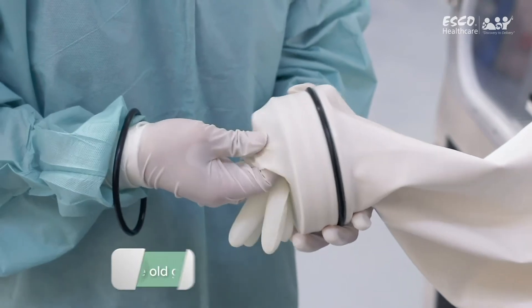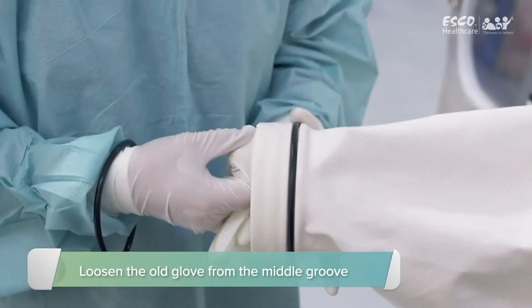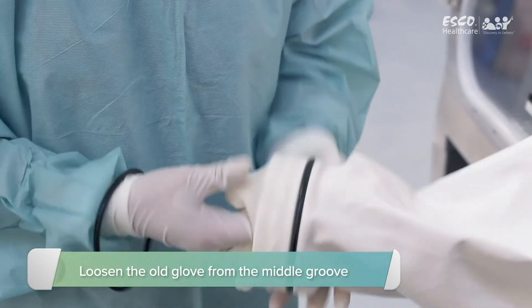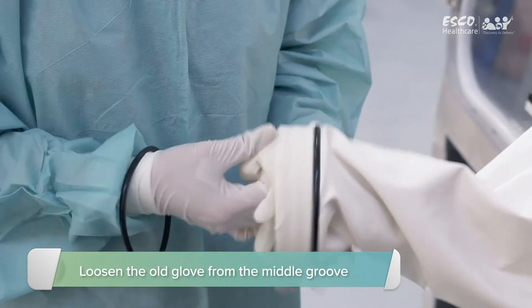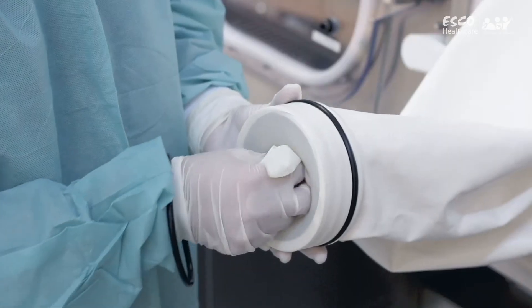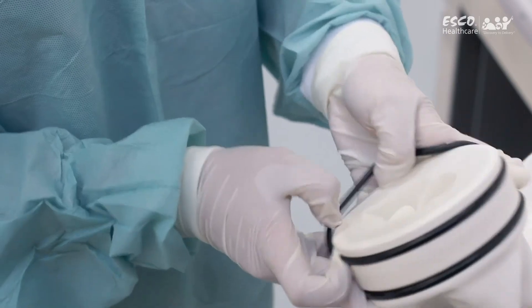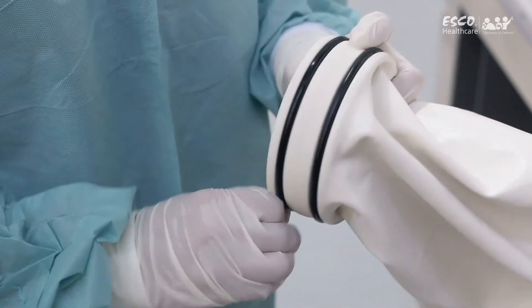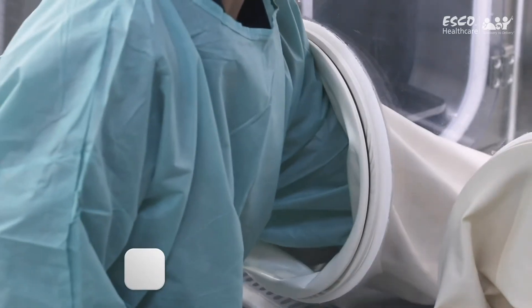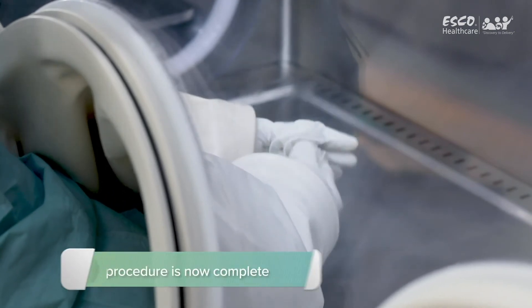Carefully loosen the old glove from the middle groove. Put the glove and sleeve inside the isolator. Working with one hand in the adjacent glove, carefully remove the old glove. The procedure is now complete.